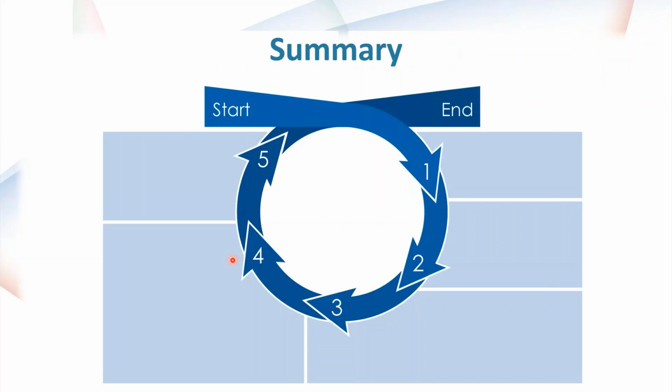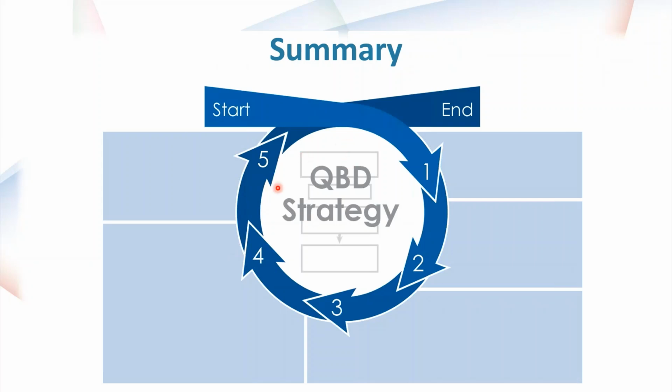Okay, so in summary, we have covered a software package that involves automation. The steps that were included were a quality by design strategy with critical quality attributes that allows the user to define their success criteria based on their available instruments and inventory. This strategy governs the 5 steps. So the first step is instrument control. And as I mentioned, we have direct instrument control with Agilent ChemStation and Waters Empower.